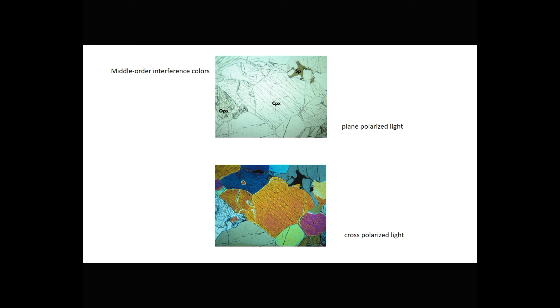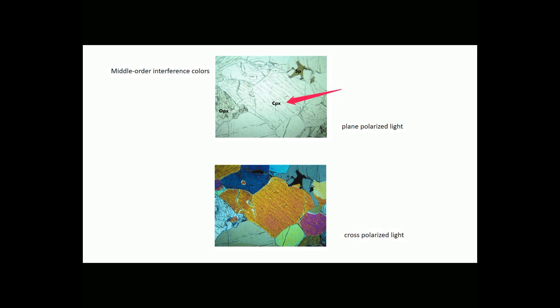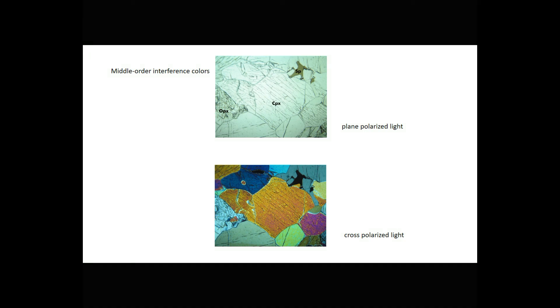Here are two views of the same thin section. The top one is plain polarized light and the bottom one is cross polarized light. In the top view, you can see a large grain of clinopyroxene in the middle that shows great cleavage. In the bottom, we see it has middle second-order colors. We can also see orthopyroxene in these photos — in the plain polarized view it shows slightly greater relief than the clinopyroxene, and in the cross polarized view we see first-order interference colors. Orthopyroxene commonly has first-order colors and clinopyroxene commonly has higher-order colors, and that's one way we tell the two minerals apart.